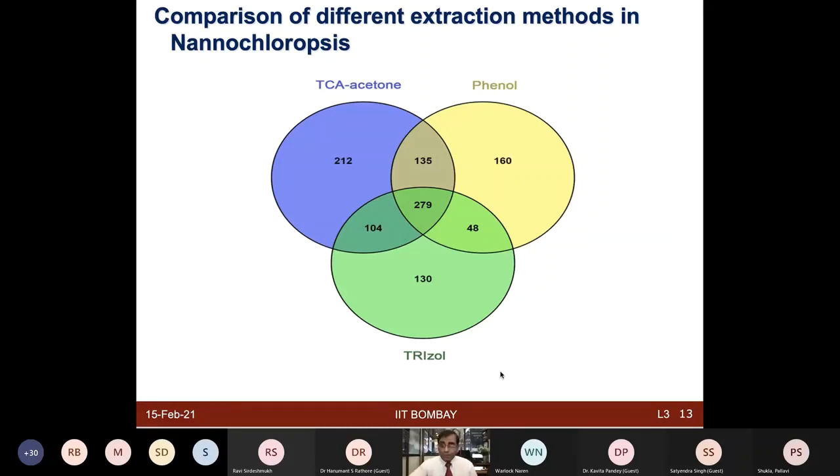So many times, if you want to claim that you want to do a proteome-wide investigation, your goal is to identify as many proteins as possible, right? For example, you read Professor Matthias Mann's paper, and the goal over there is to get closer to the whole proteome in a single shot run, right? They showed very nice papers on the yeast, for example, in single shot 2 hour, 3 hour injection with the same sample unfractionated, you can totally try to map the whole proteome.